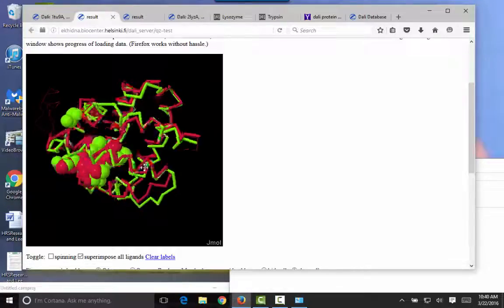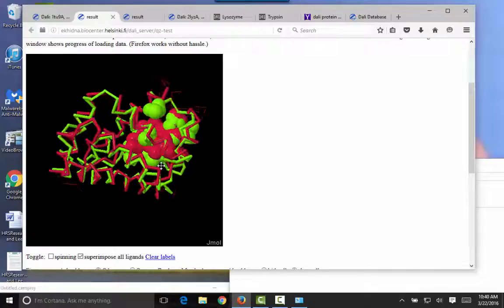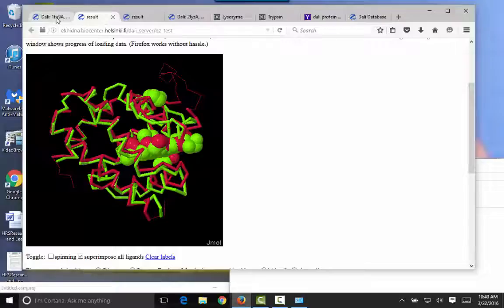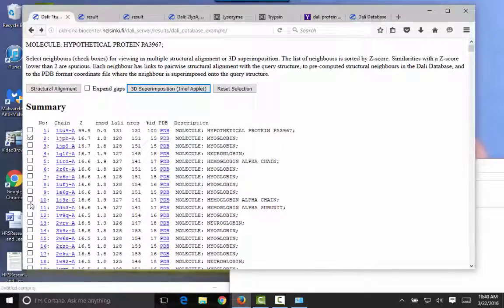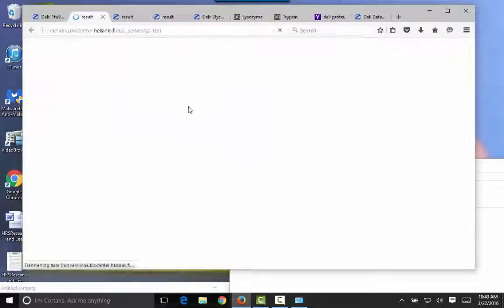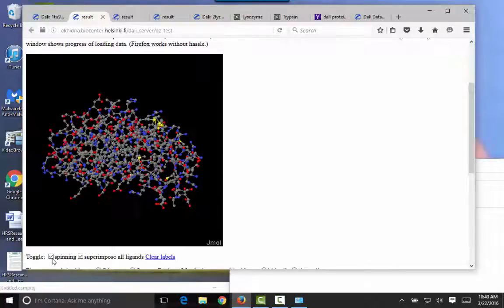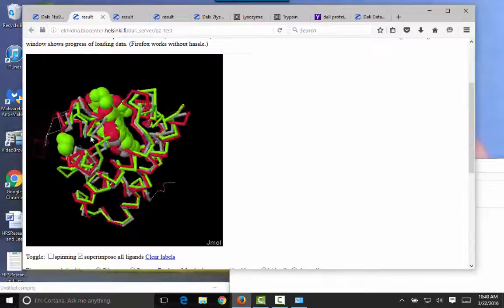So this can help you out a lot with looking at matches, particularly if they match up to maybe where you assume your active site is going to be. So it's a good tool to be able to use. I haven't played with it, but I think you can even line up more than one. It's a nice tool to be able to compare multiple sequences.